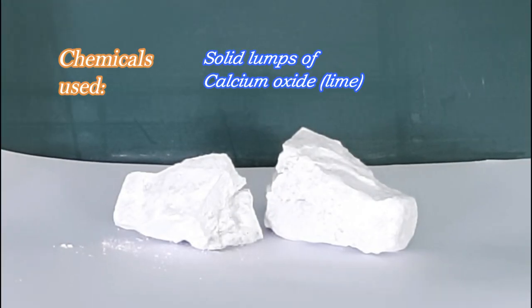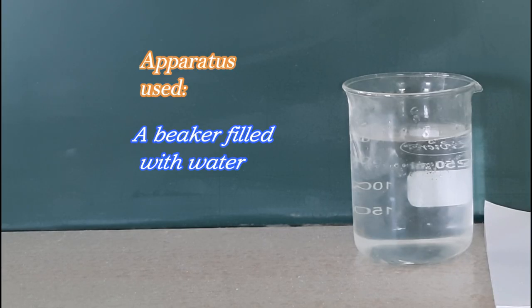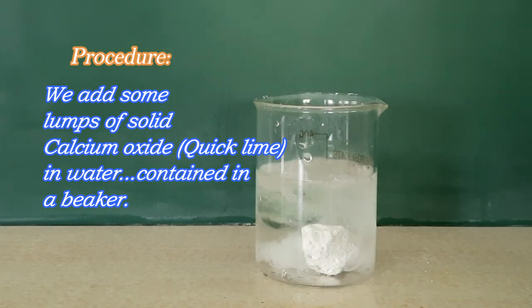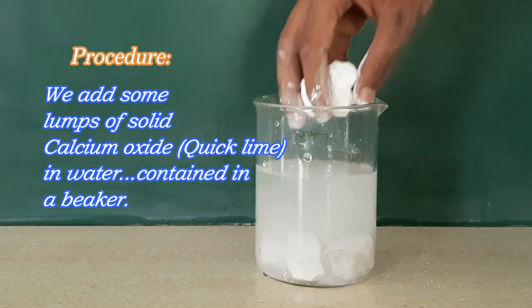Chemicals used: solid lumps of calcium oxide or lime. Apparatus used: a beaker filled with water. We add some lumps of solid calcium oxide or quick lime in water contained in a beaker.